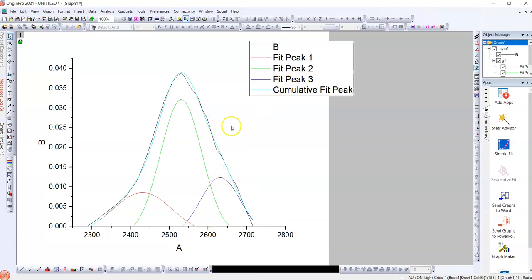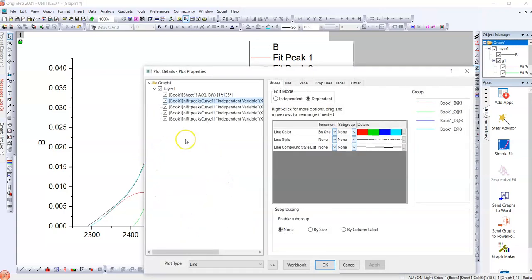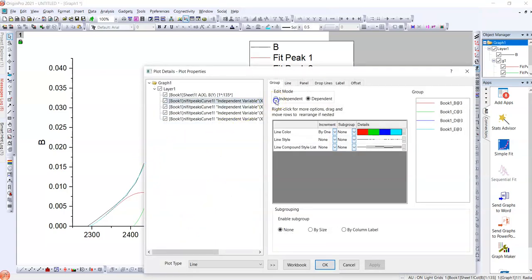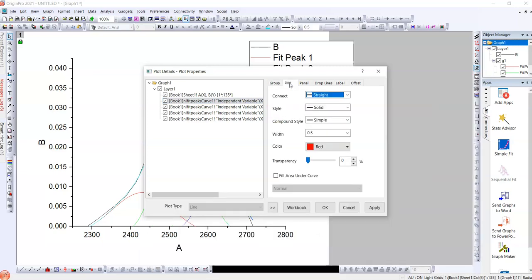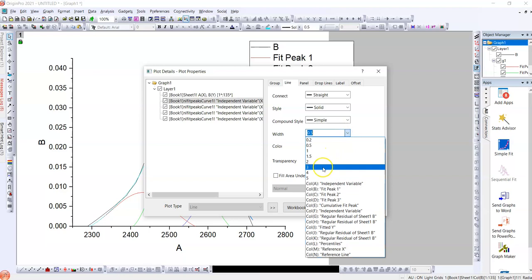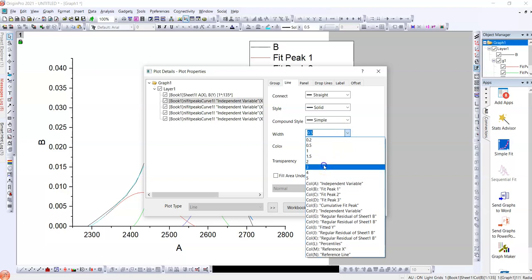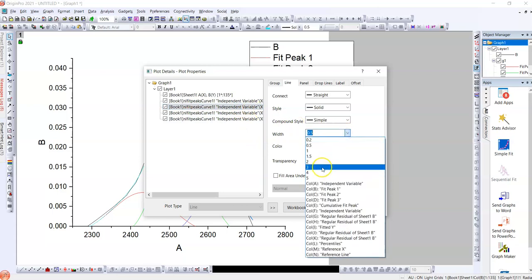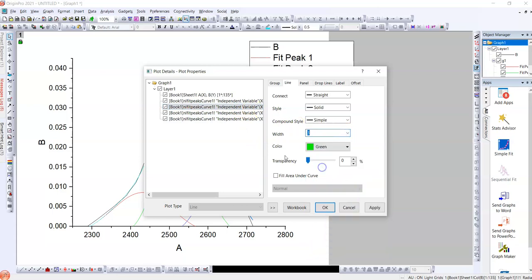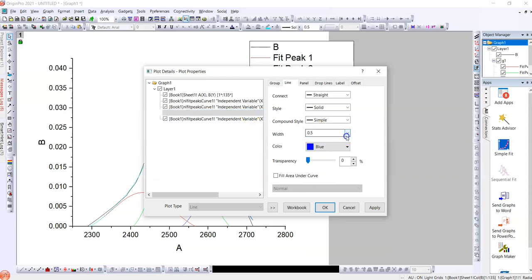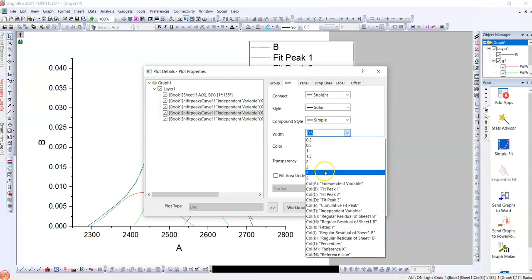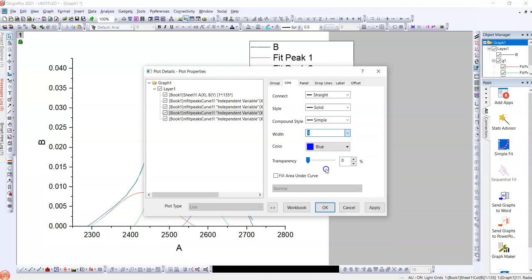However, I will right now show how to show much better this curve. I put only the independence. Here the red one, I enlarge the width of the red one to three. And same I did for the green one, three. And last one is our fitted plot.